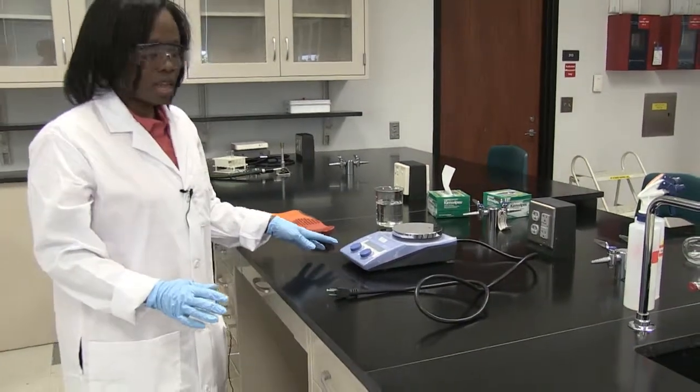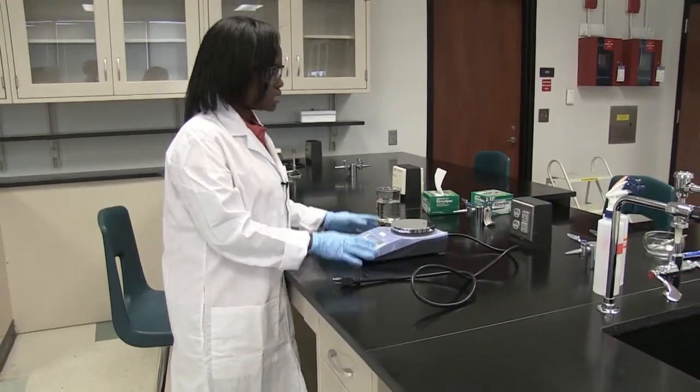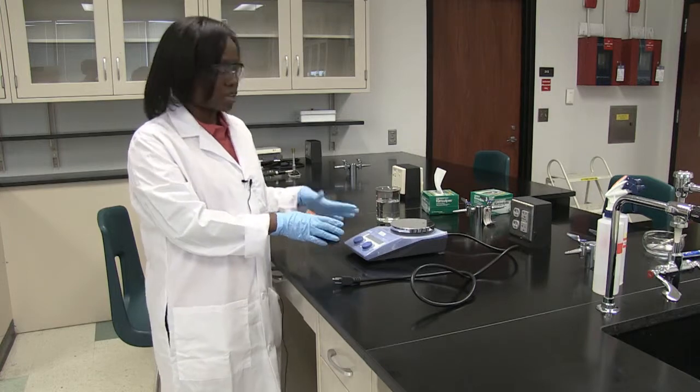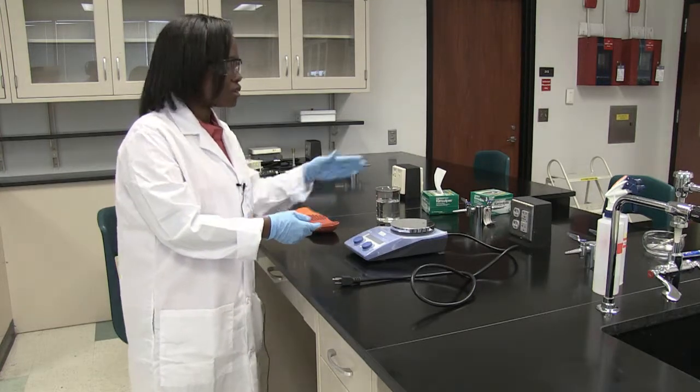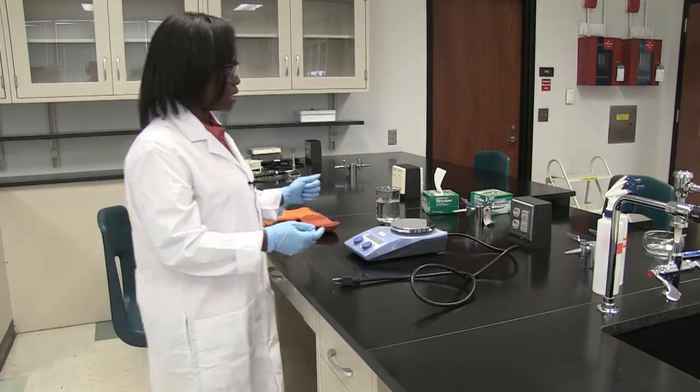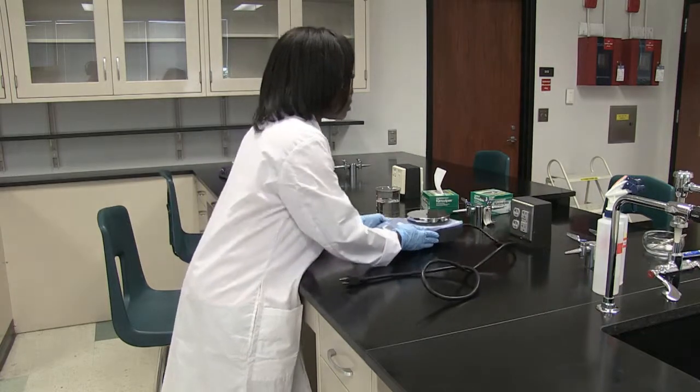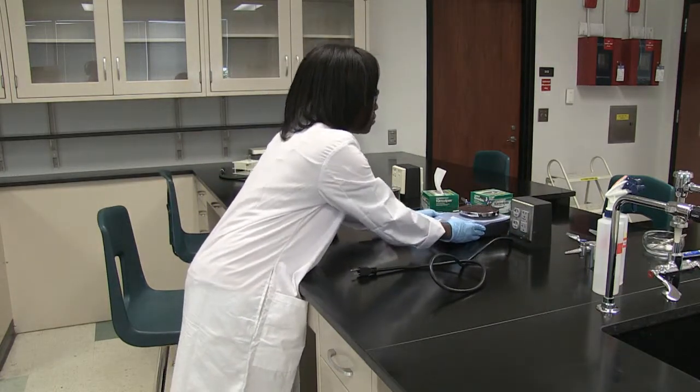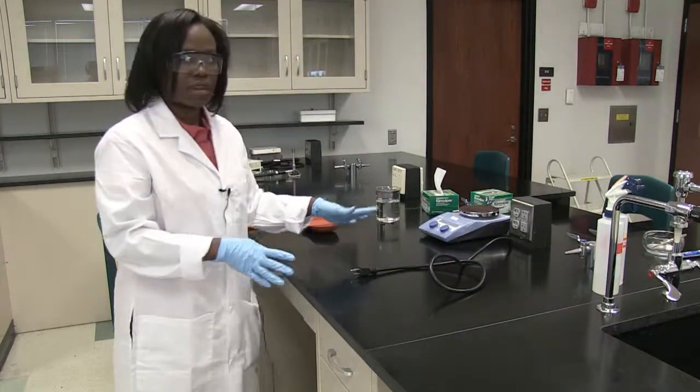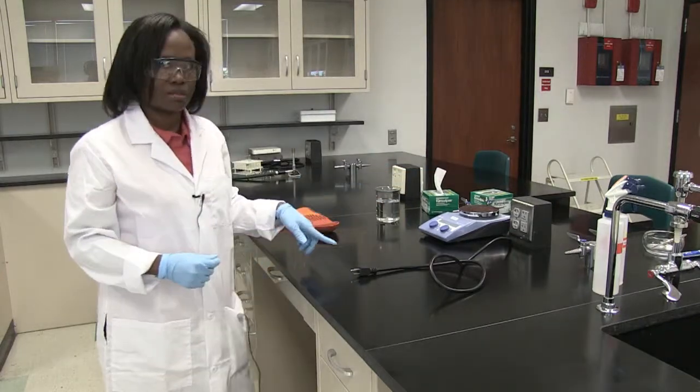It's still hot. If your classmates look at this, they may not know it's hot because you cannot tell by looking, but if you put your hand there, you'd definitely know it's hot. You don't want to do that. Make sure you put this away securely out of the way so that no one will touch it and harm themselves.